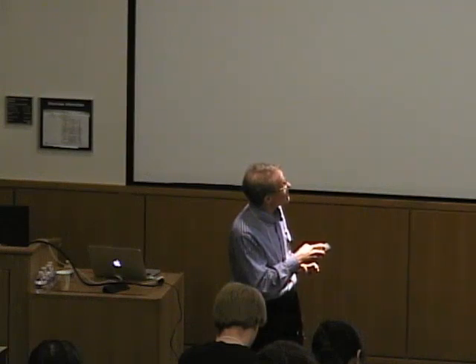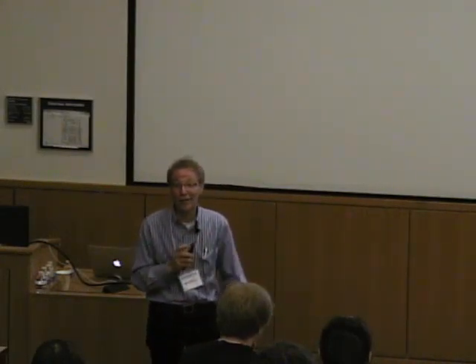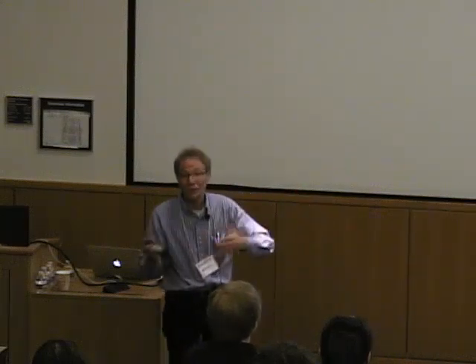Is there coupled deprotonation or protonation that accompanies binding? Something we've found to be particularly insightful is this competition between metal ions and protons. Okay, you can imagine this is pretty important to biology. And the technique of isothermal titration calorimetry can be used to quantify proton-coupled deprotonation and protonation. Okay? Eventually, of course, you can pull out the entropy from this information. And, you know, I still don't know what entropy is, but we get a number for it.